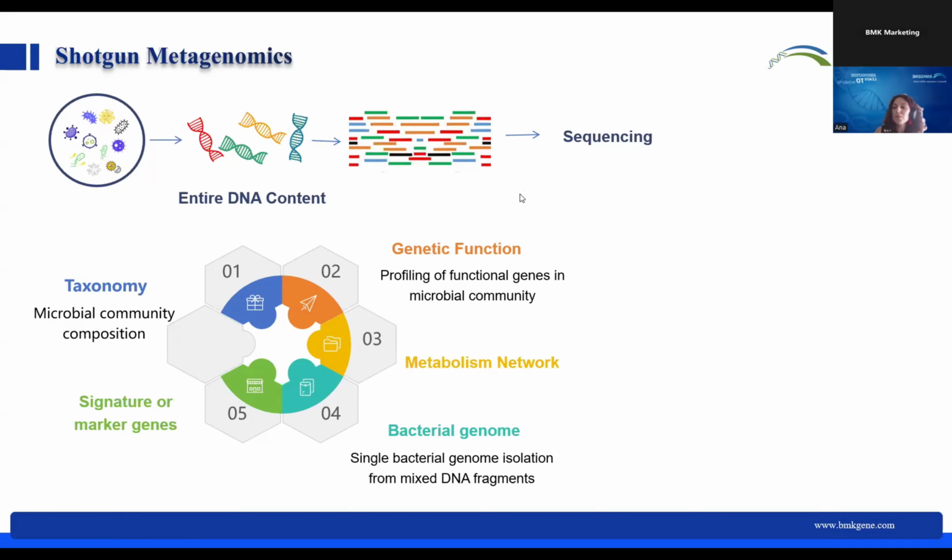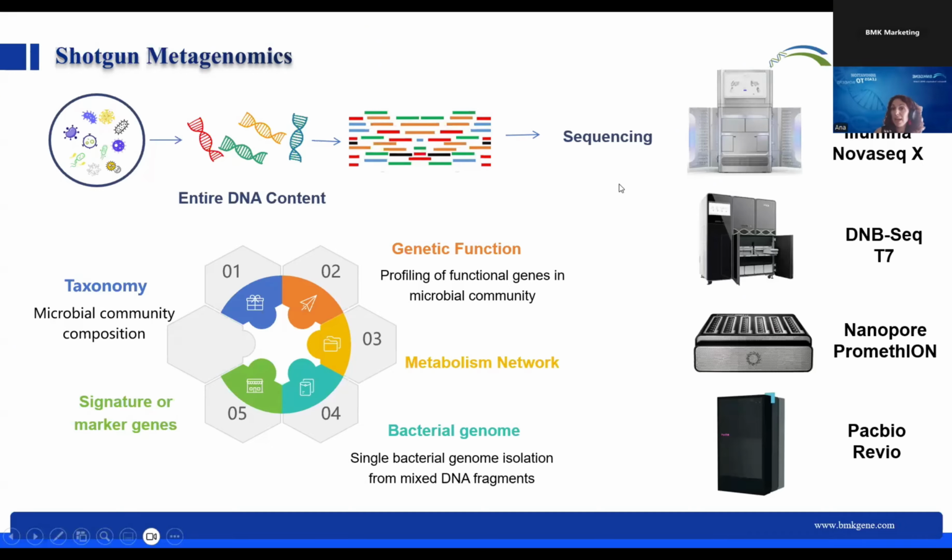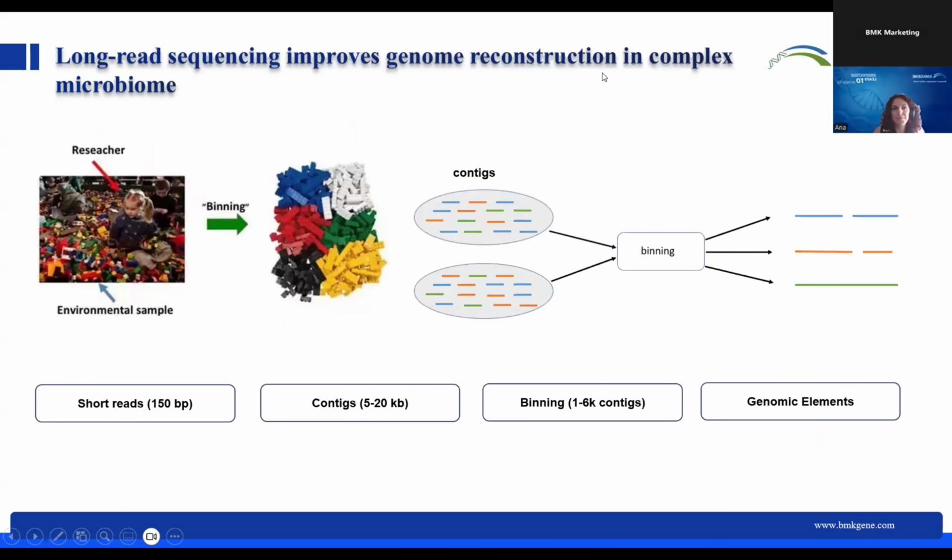Regarding the sequencing technologies we are using, we are using these 4 technologies: Illumina, DNBSEQ, Nanopore, and PacBio Revio. So now I would like to talk a little bit about why we use each one of these.